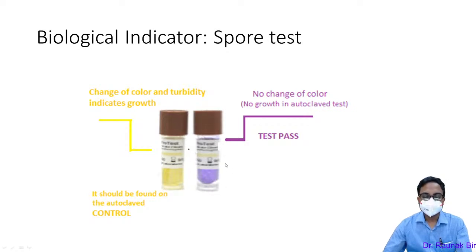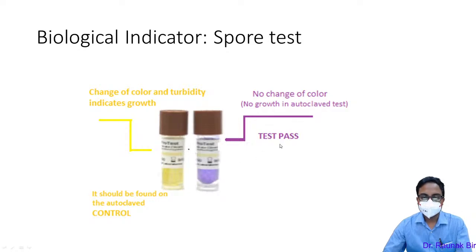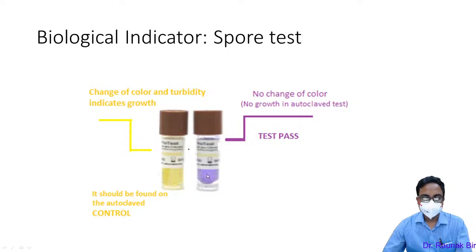In the spore test, the indicator is bromocresol purple. If there is no change in media color, the spores have been killed — no growth, no breakdown of glucose to produce acid, no pH change. If there is growth after 48 hours at 60°C, acid production from glucose breakdown causes a decrease in pH, changing the color from purple to yellow. This color change as well as turbidity indicates that the autoclave has failed.